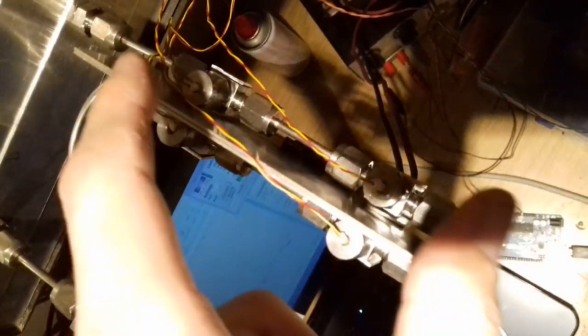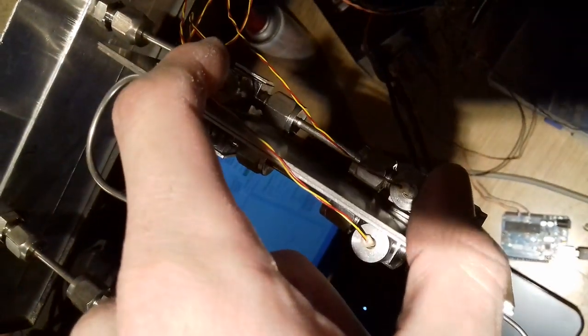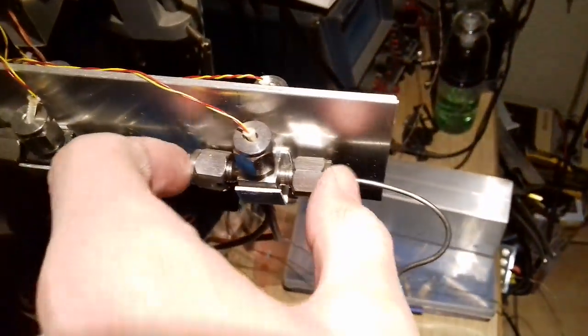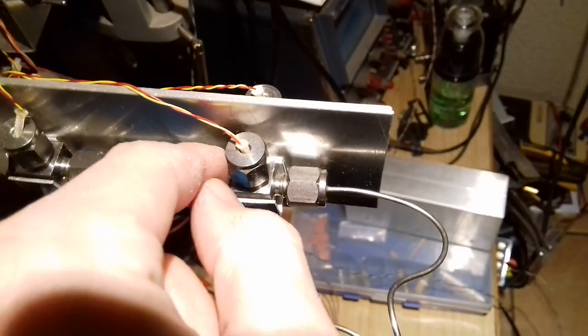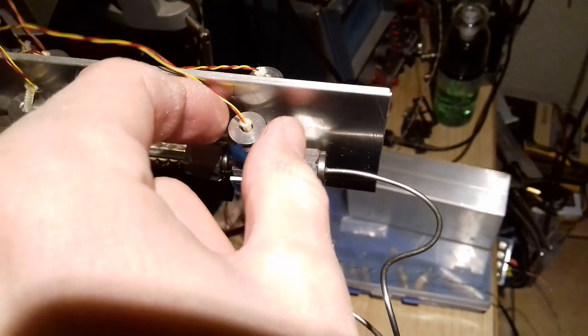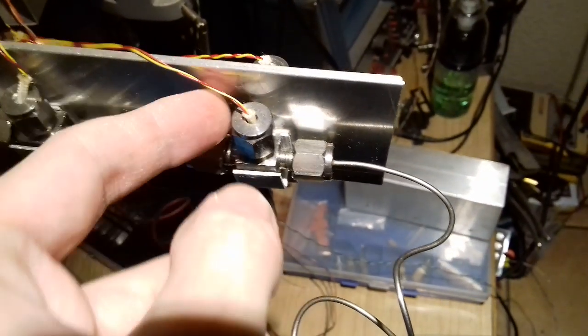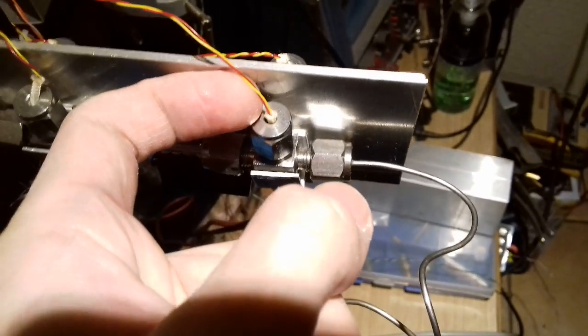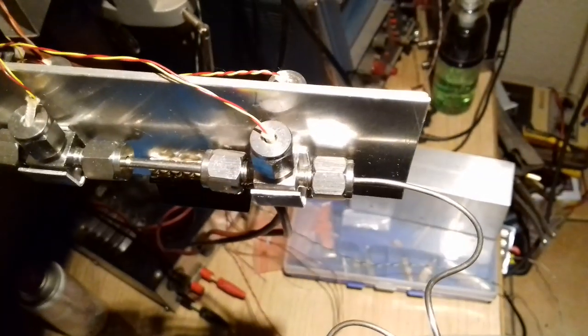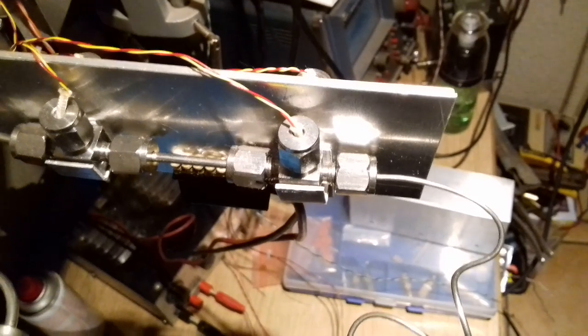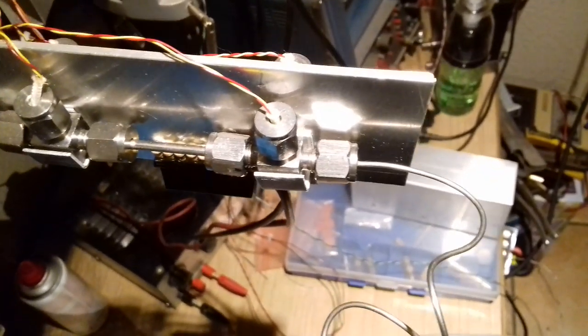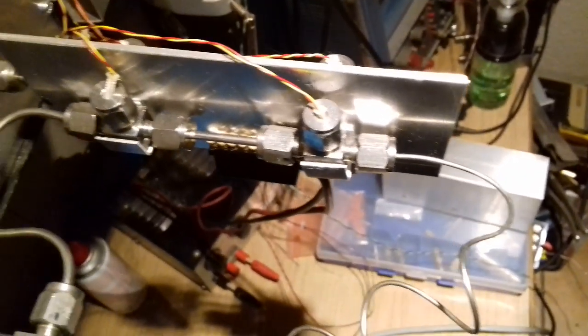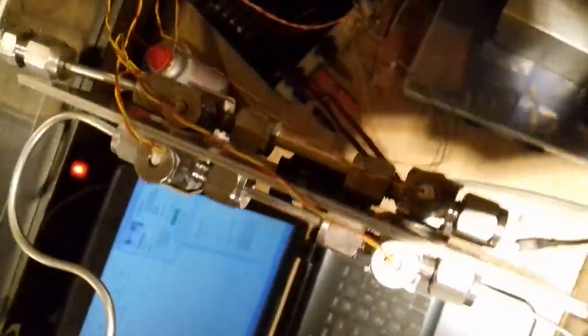The column then exits through the detector side of the thermal conductivity detector. This is just four elements of these T-fittings. In the third port here, the side port, a little instrument light bulb - which is also one-eighth inch in diameter and has been ground open - is sitting as an element. That's then heated and reacts to the thermal conductivity difference between the carrier and the outlet of the detector.